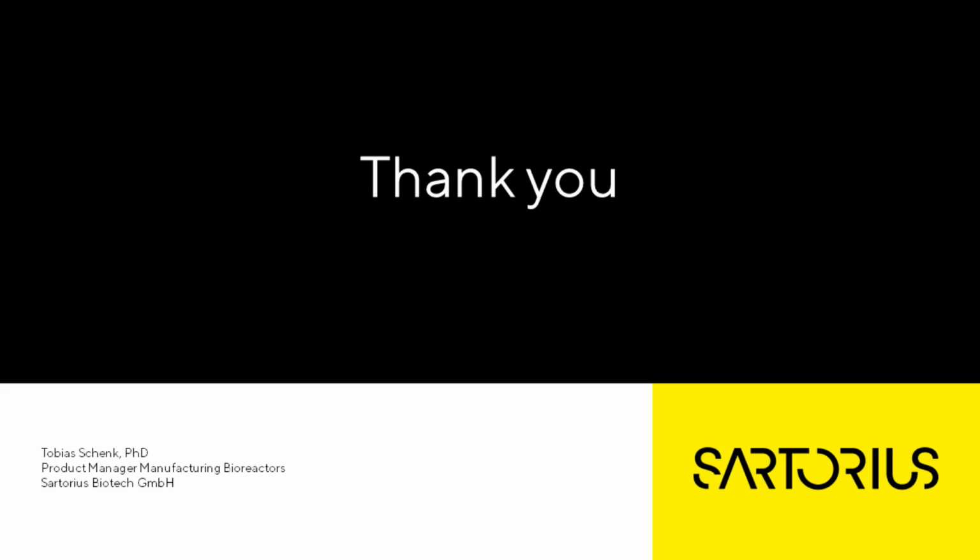depends on how fast you stir. And with the rocking motion, wave-induced, what I showed at the very beginning, the slide, there you don't have any active gassing, meaning you don't have any gases or gas bubbles which could pop at the surface. So this causes less shear stress, and as well the rocking motion. Again, here depending on the speed you apply to the rocker, it is less harmful to the cells. At least when we see this also in publications, for example, immune cells mainly are cultivated in rocking motion versus stirred bioreactor tanks so far.